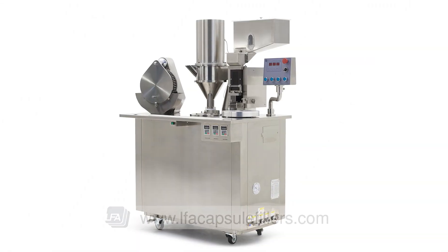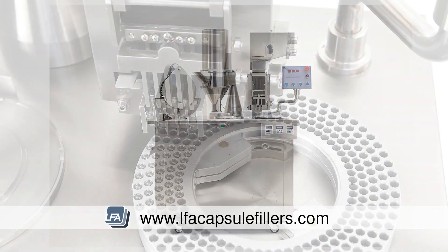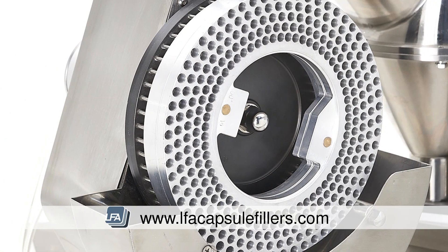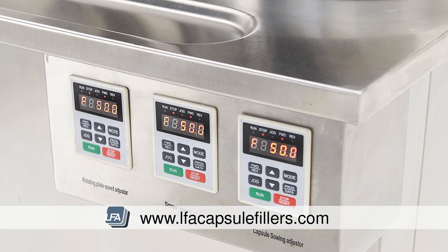SACF25 semi-automatic capsule filler from LFA. Capsules are often the consumer's preferred choice but often viewed as costly and difficult to produce. The SACF25 solves both these issues with a fast, efficient semi-automatic filling mechanism.